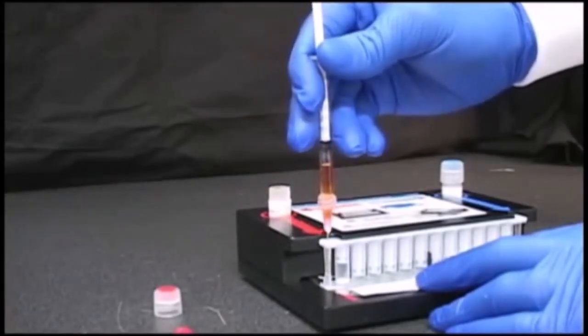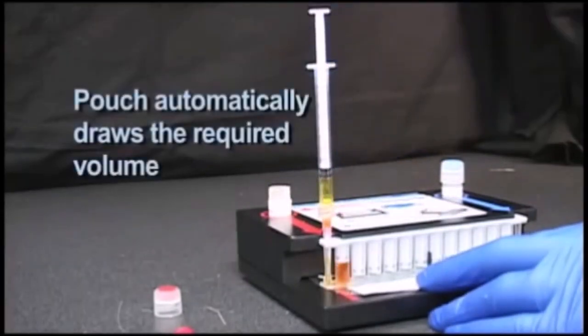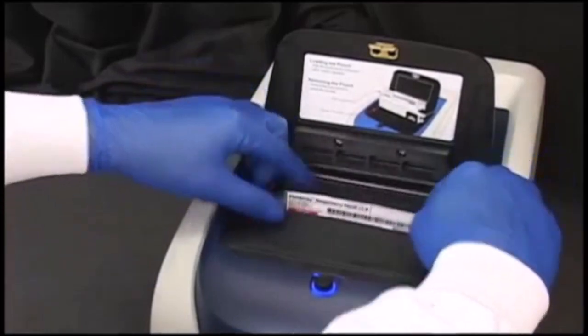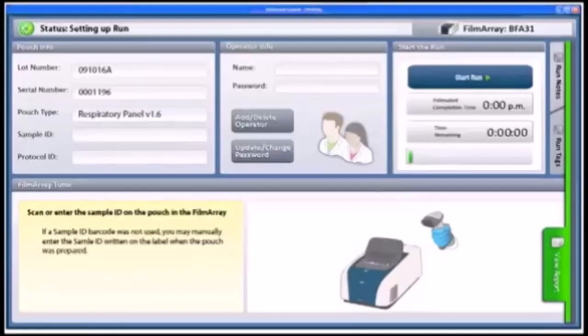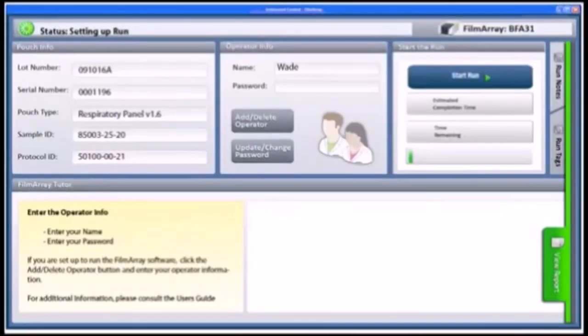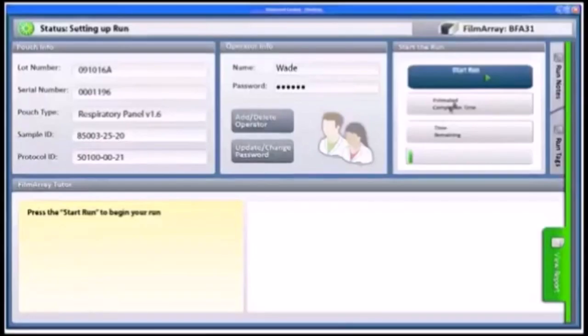The second step is the hybridization or annealing of the two oligonucleotide primers when the solution is cooled to 54 Celsius. The third one is the DNA synthesis or elongation, which occurs by heating the solution to 72 Celsius, which is the optimal temperature for the DNA polymerase.